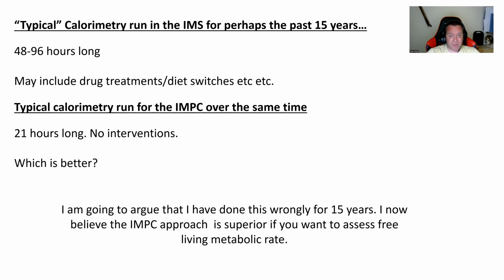So what you consider to be a very short period of time. And so the question is, which of these is better? And intuitively, you feel like more time equals more data equals more reliable. And this is certainly what I thought. But I'm going to actually argue that I think I've been doing it wrong for 15 years with these 48-hour calo runs.